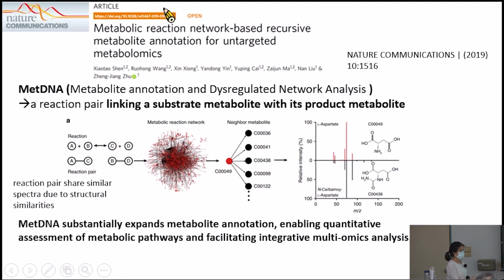This case is the same as the previous case. One sample will have multiple peaks, and multiple peaks represent the fingerprint of the sample. So it is not possible that one sample has only one peak. Okay, thank you for the interpretation.